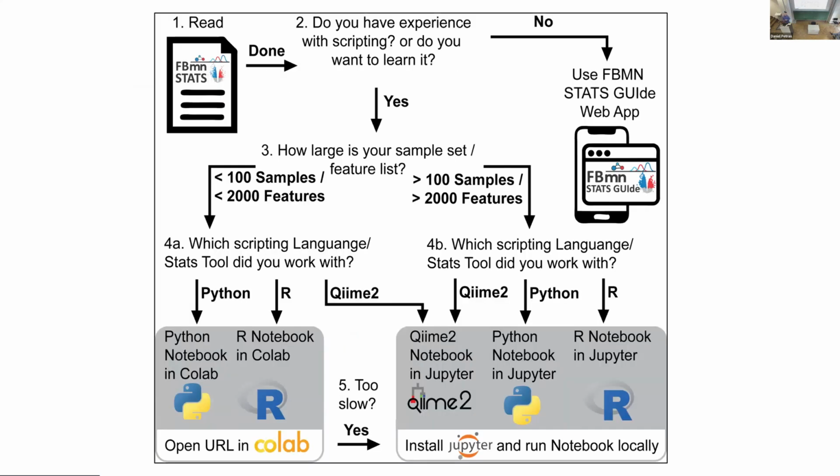And I just want to reiterate really quickly on what way to choose if you want to follow this hitchhiker guide. This is all part of a larger protocols paper that we wrote, which I think should be a good starting point if you want to do statistical analysis. As you've seen, there are also other tools that are excellent, like MetaboAnalyst would be one of those. And I'm sure there are many other Python and R pipelines that people developed. So there are a lot of different ways to do exactly the same thing. What we do, obviously, as we wrote this, is what we control.